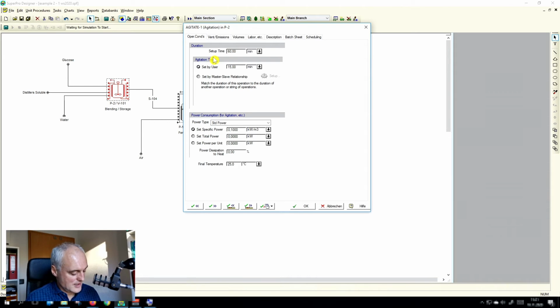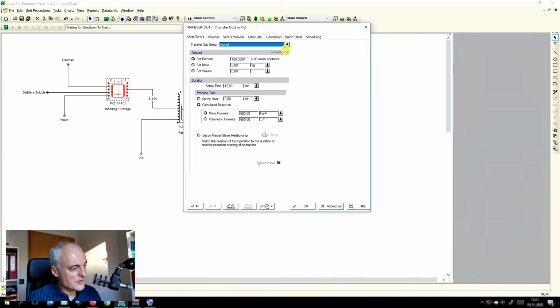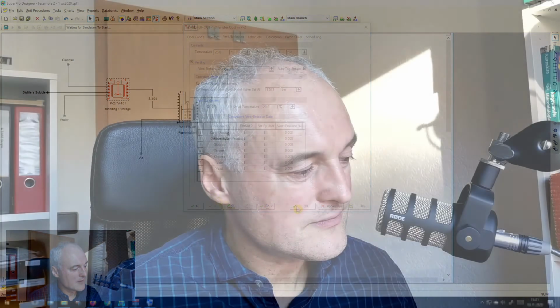And finally, we have a transfer out operation. For the transfer out operation, we need to initialize what stream it uses, and this is stream 104. And now, as we are so correct, we also set venting. Okay, so now we have initialized the operation.